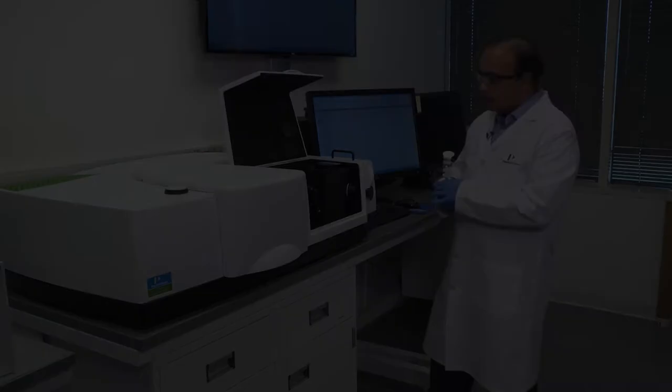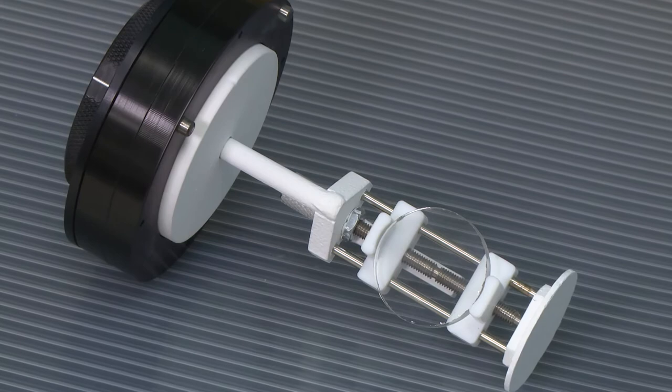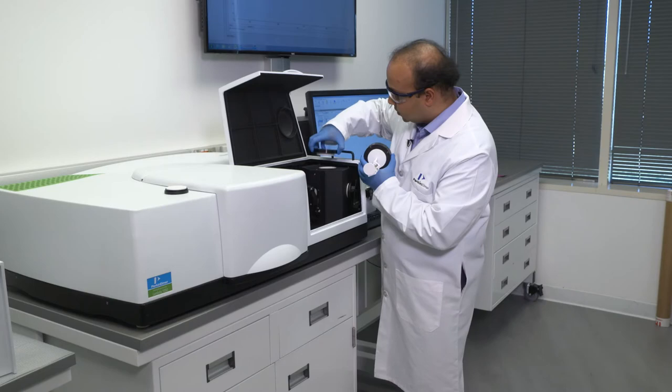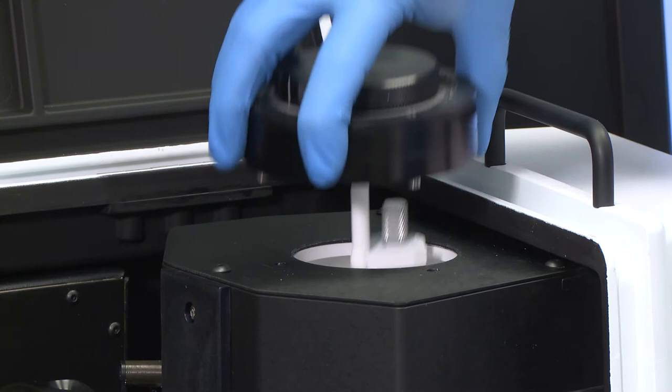Now it is also possible to make measurements inside the integrating sphere. So here is what we call as a center mount accessory with a sample mounted on it. This is what we call as a jaw style accessory that will help clamp the sample in between the two jaws. To make a measurement, we'll remove the top part of the sphere here, and then pretty much drop the center mount accessory right inside the sphere.